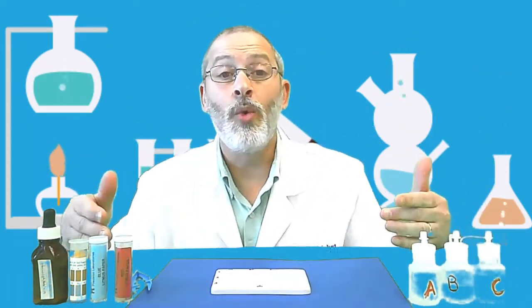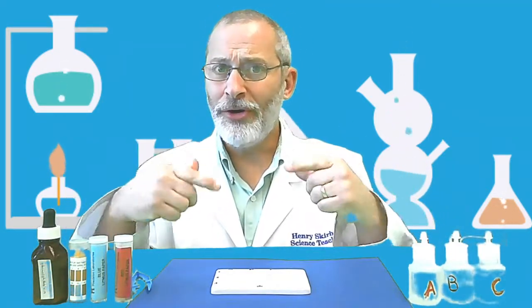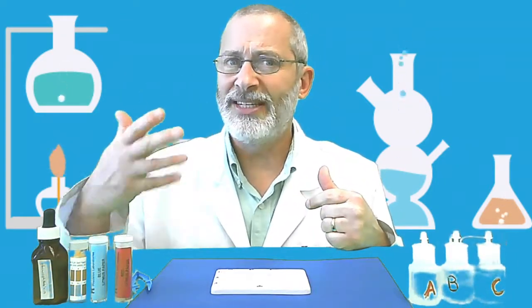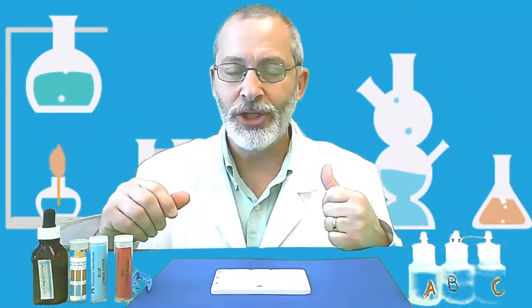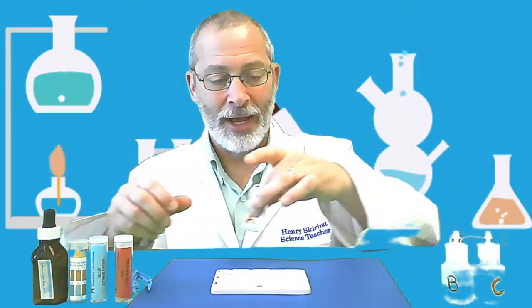Now, I know what these 3 solutions are, and I've already been using my sense of smell to detect an odor for each. Not easy for you to do at home, but I will tell you.